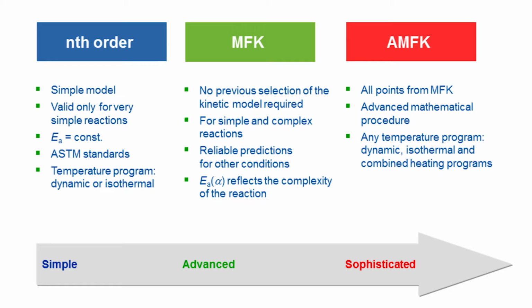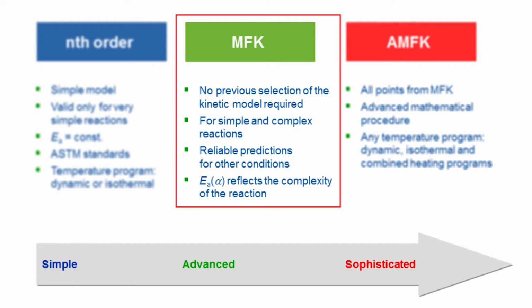The kinetic calculations are based on 3 or more dynamically measured conversion curves. Advanced Model Free Kinetics is the most sophisticated method of the 3, and extends the possibilities of MFK in that it can use any dynamic or isothermal temperature program, or a combination of the 2. This video describes the procedure of Model Free Kinetics, or MFK for short.